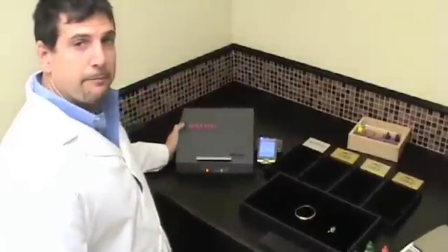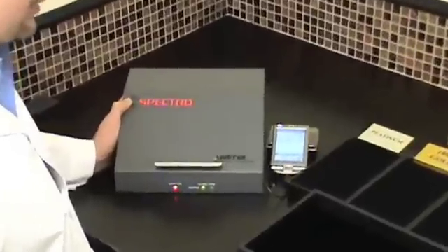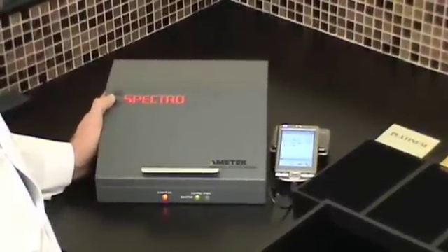We use a spectrometer and this device here is an x-ray device that will x-ray each item that we place in there and tell us the complete metallic composition of the item.